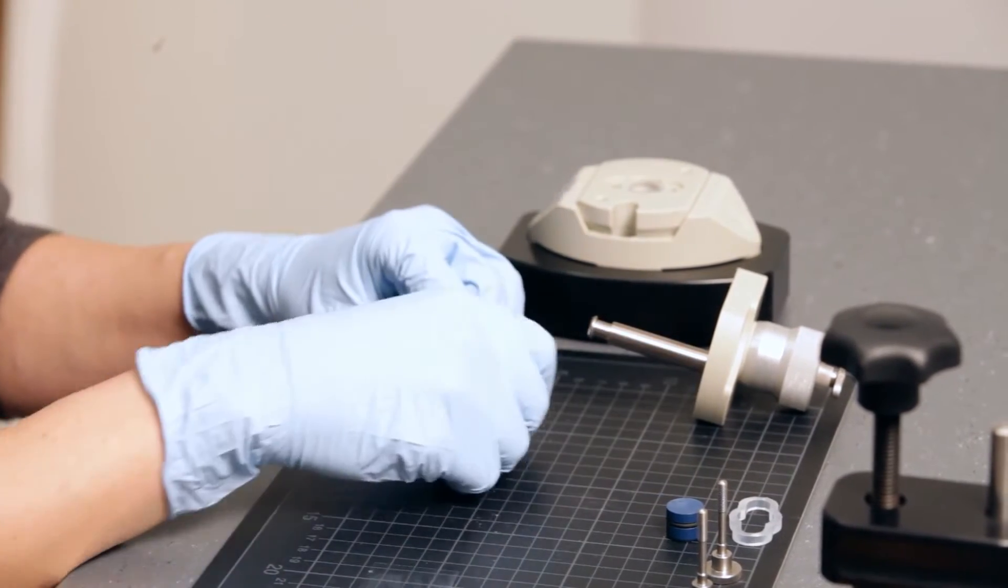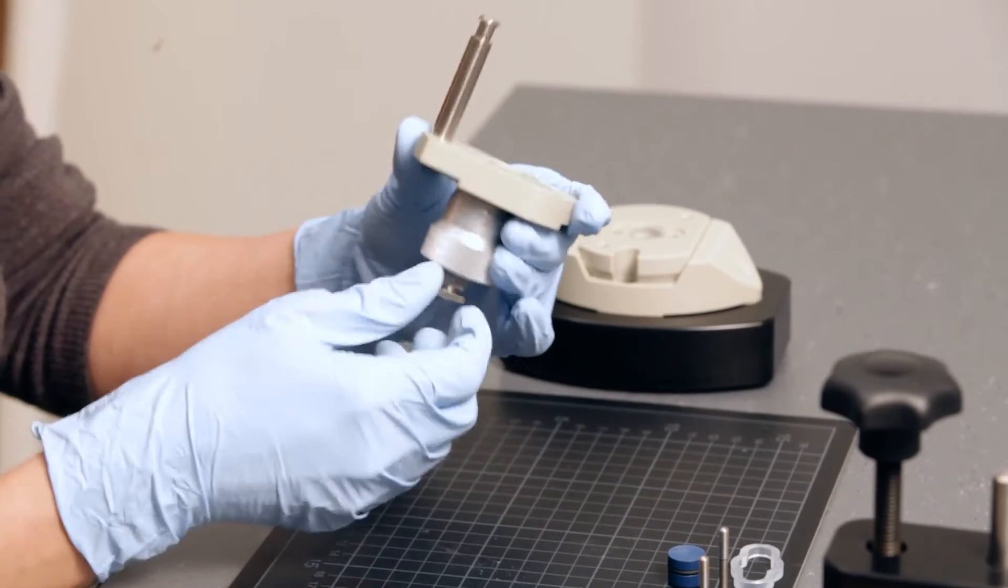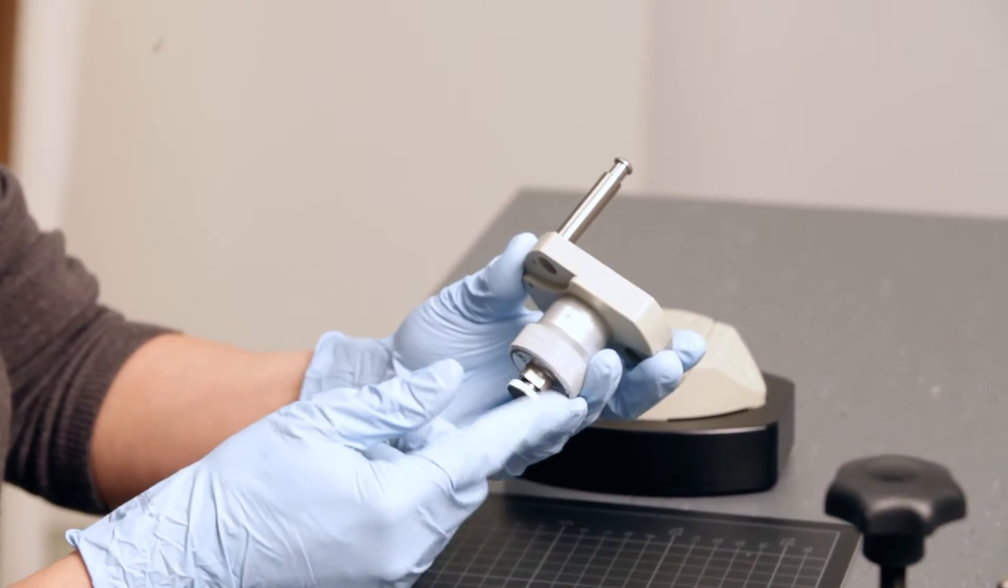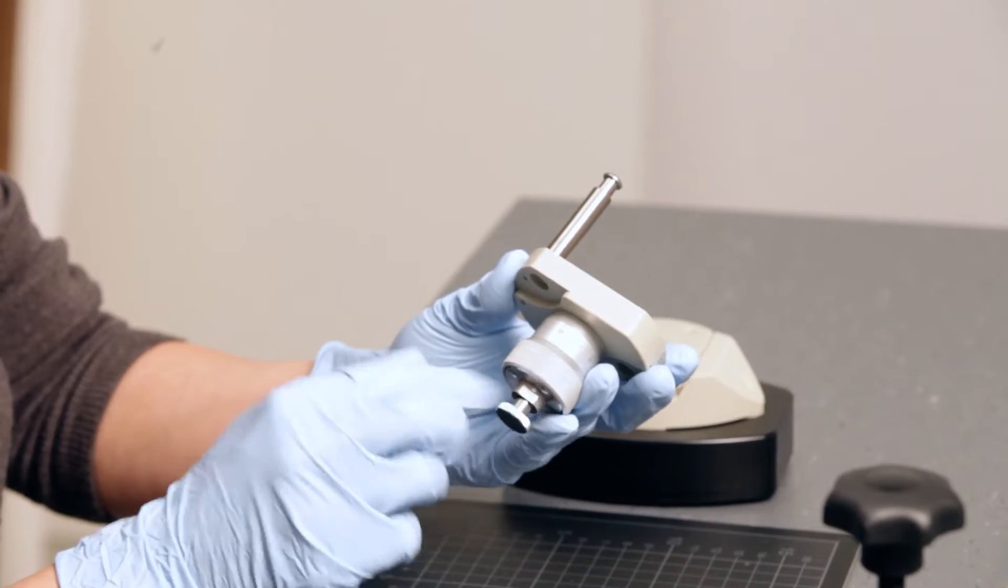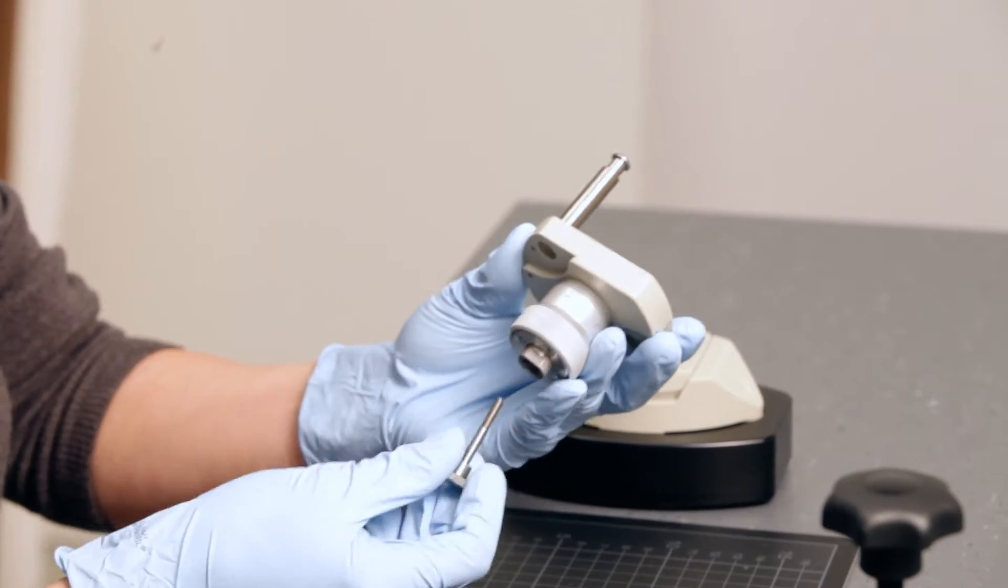To remove the sample holder of the upper part of the cell, loosen the screw at the adjustment knob and use this screw to push out the sample holder.